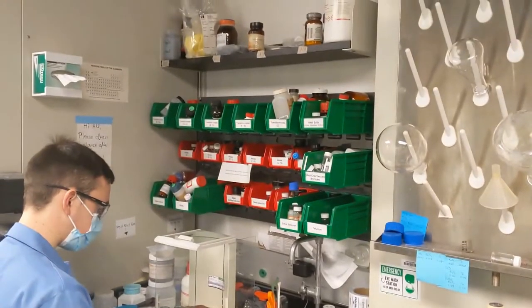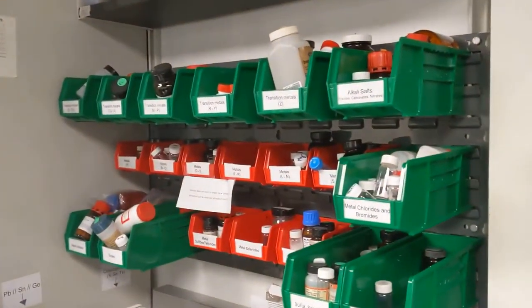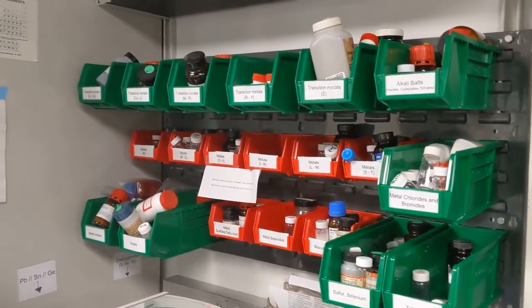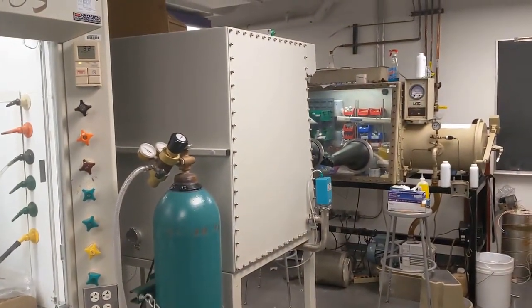Here we have where the preparation of all the samples begins, with the weighing out of the reactants. One thing that's unique to the Kanatzidis Group is that we actually have an incredible variety of reagents to choose from — from pretty much the entire transition metal block to certain metal binaries, and even within the glove boxes, a wide variety of rare earths.